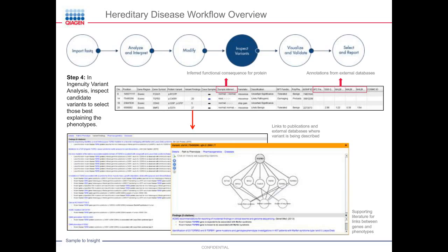And this ontology is used. So when you have a variant in a gene, and this gene might not be directly associated with the phenotype, then the tool or the filter can make an association by using the knowledge base and the ontology and say, for example, this gene is in a pathway with another gene, and that gene is associated from the literature with that disease.